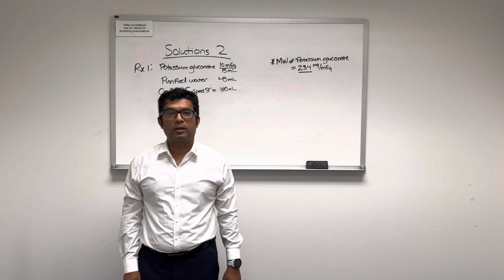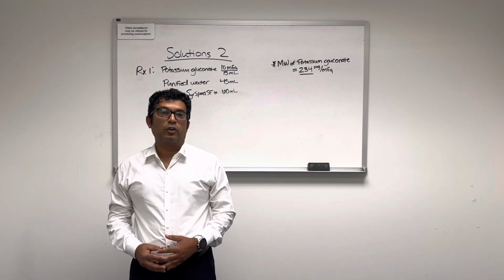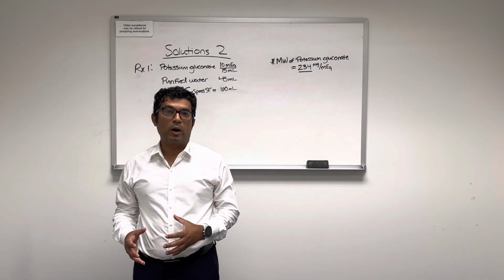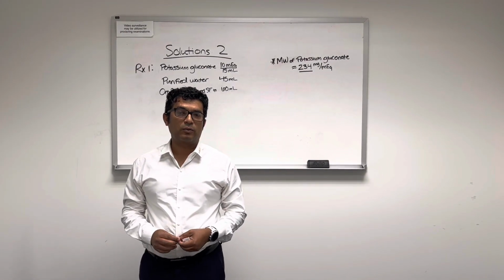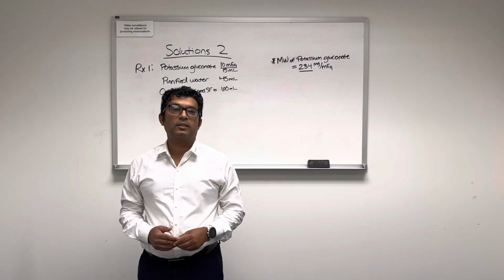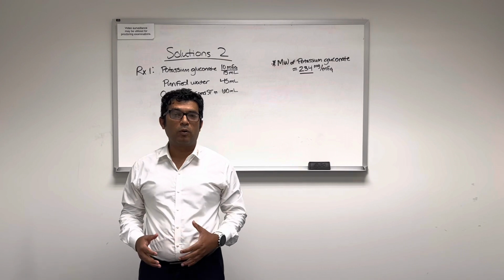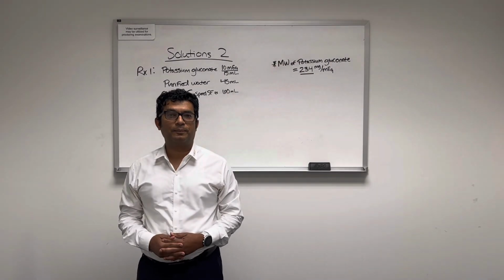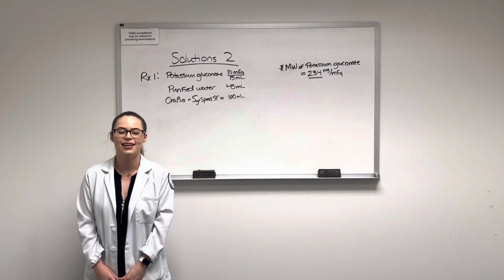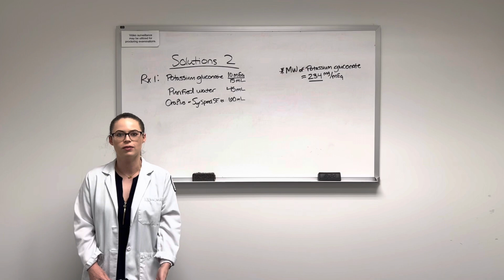Today we'll go over solutions, because in compounding pharmacy, solution drugs are a major part. We already had a solution lab last week, but we are also going over some more solutions today. Like before, Haley will go over the solutions with the calculation and the lab method. Hello everyone, it's Haley again, and today we have 3 more solution prescriptions we'll be going over.